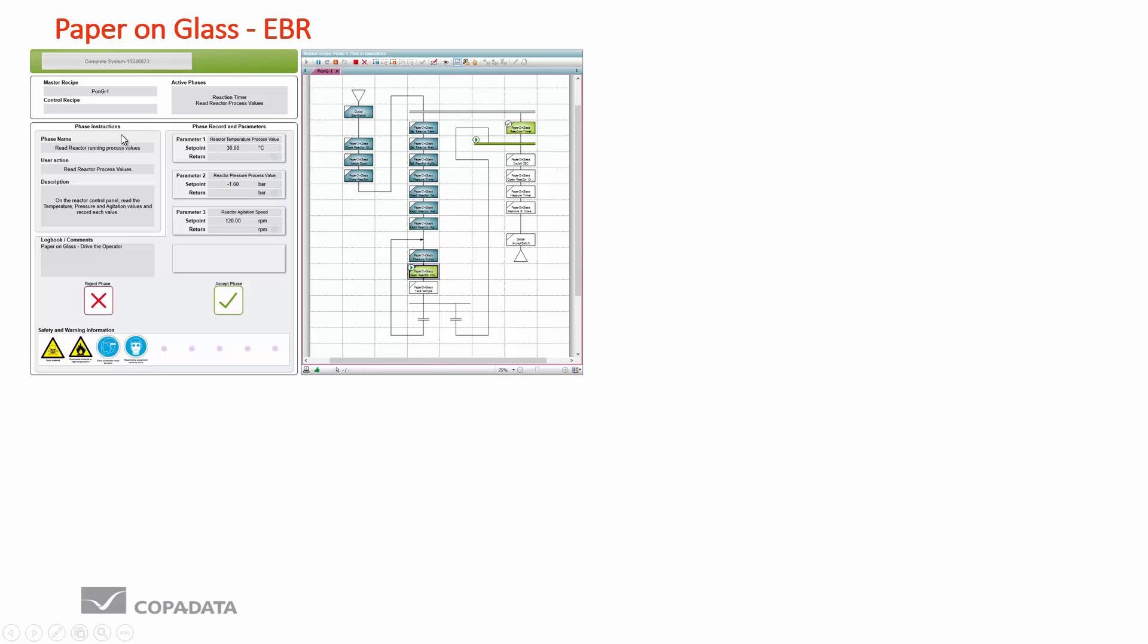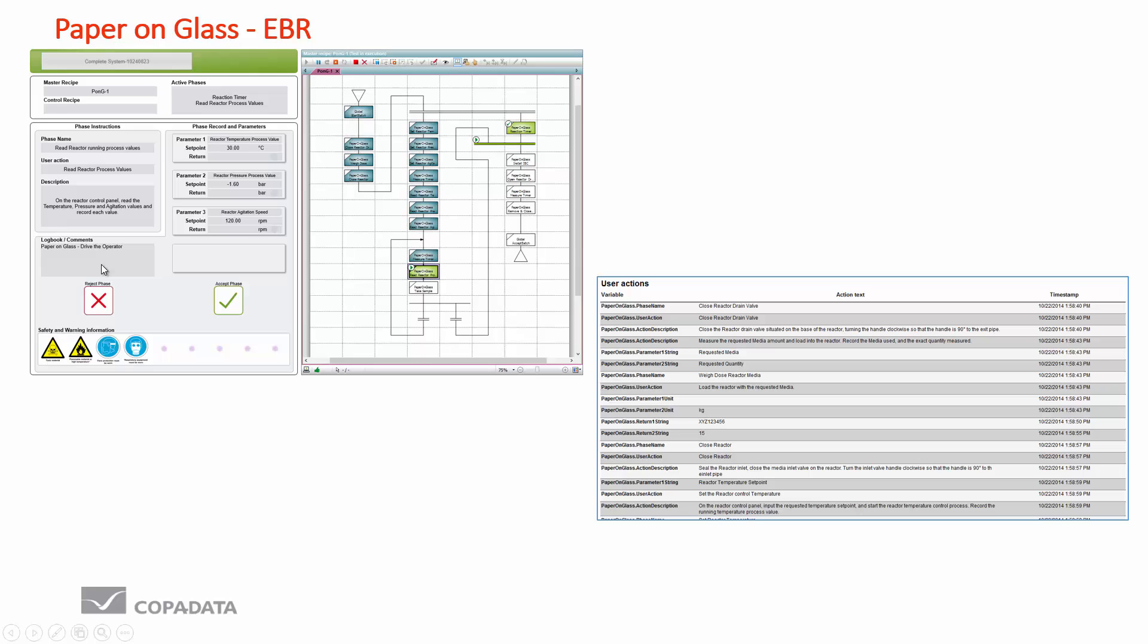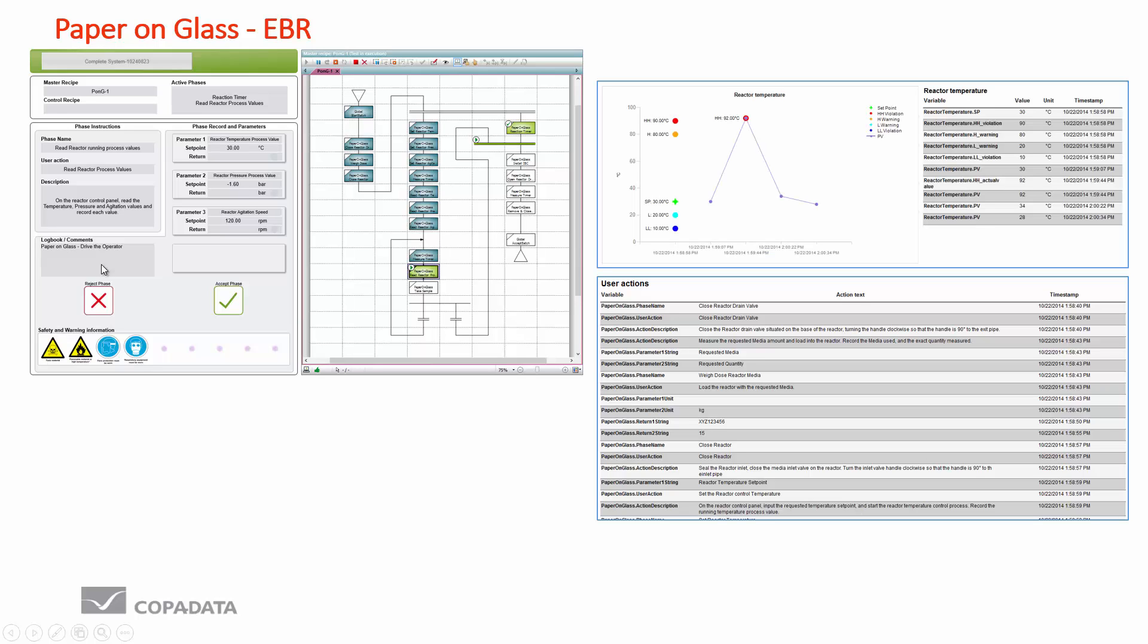On the left hand side we can see that phase by phase, task by task, the operator gets a very clear instruction of what is needed to be carried out. At the bottom we get certain hazard information and safety equipment advice. In the middle section we have a recording area where the critical quality attribute values can be recorded for each individual phase. Without these values being populated we are not allowed to continue the batch, or we can reject the phase if we have a certain comment. Incidentally the comment can be added to at any point in time, therefore we have an electronic logbook in the system as well.